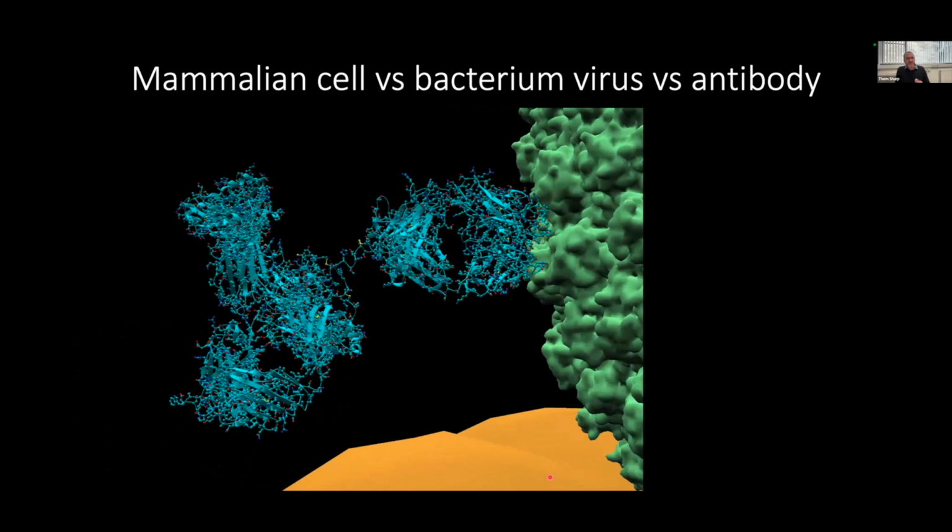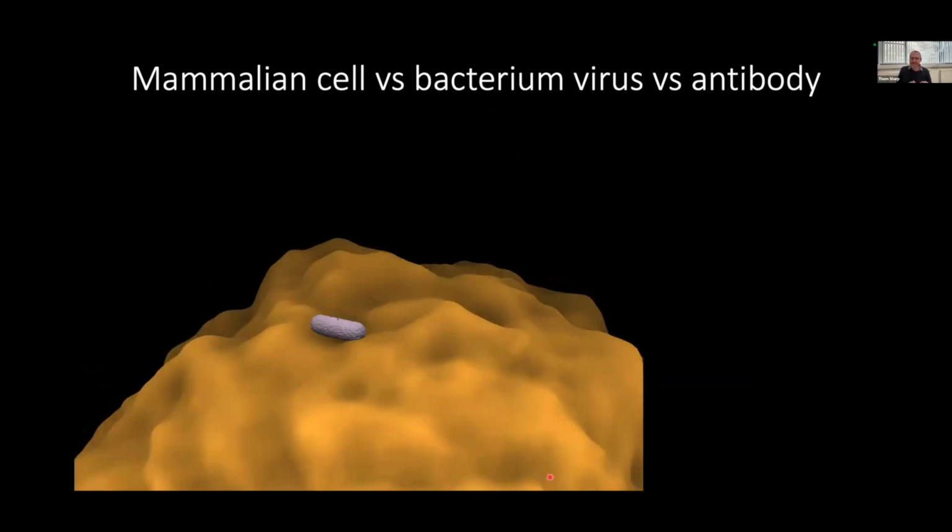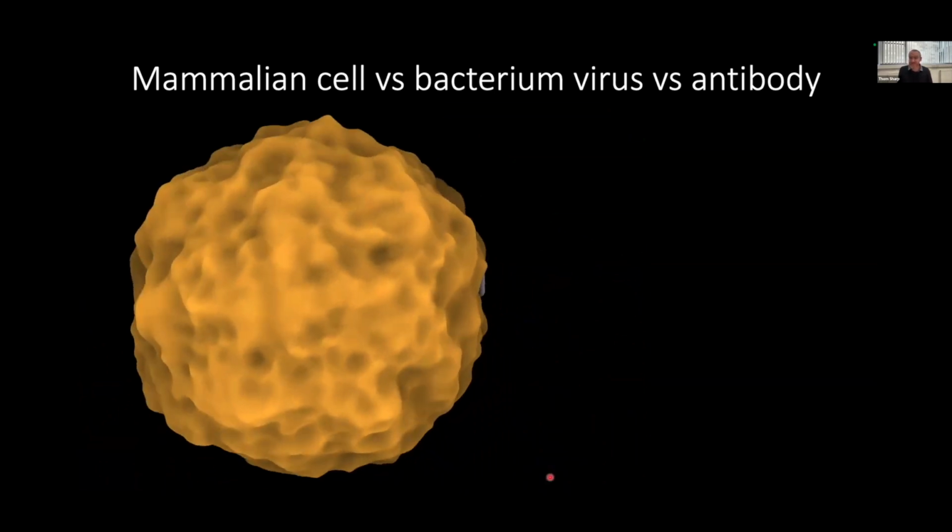Now this movie is to scale, so you can see that proteins are tiny. But with EM, we can see them. Cryo-EM lets us see their constituent atoms. So now we have a different problem. Even though we can see them, how do we find these tiny proteins? Well, by using biochemistry, we can add a fluorescent protein to our molecule of interest, guiding us where to look.